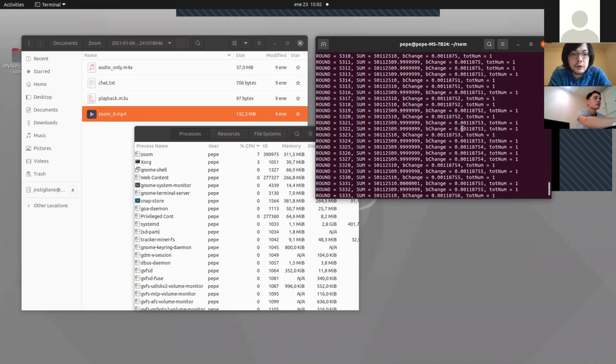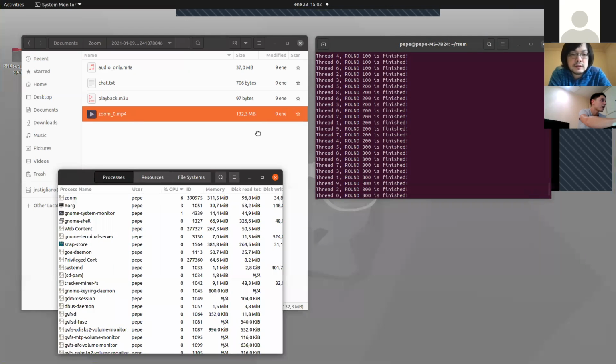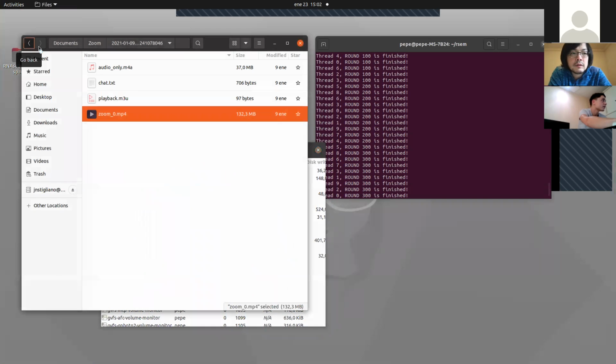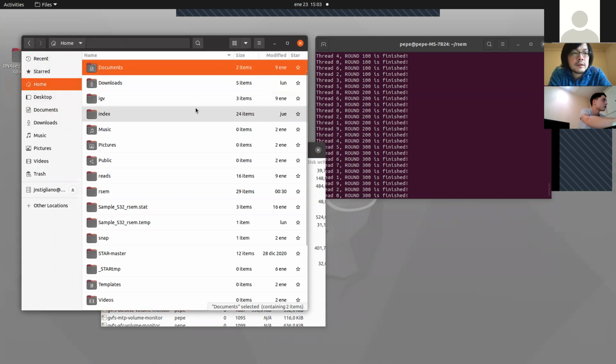Can you open the files for the other ones? Yes, I did want to mention though, I had an error using the GTF files that we prepared last Monday. I used the reference genome without the SMN2 gene. I saved the error I found, so let me show you.